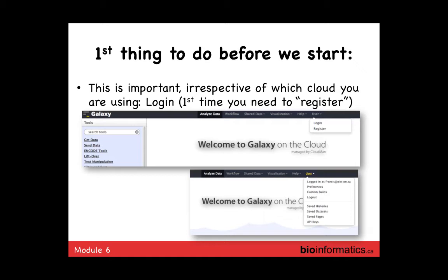Before you start in usegalaxy.org, it's good to log in and register. If you're new to the public instance, you'll register as a new user. Even if you registered on the cloud before, you'll need to register again because this is a new machine that's never seen you. Once you've registered and logged in, you'll see your full account information — the ability to save, view history, saved items, and so forth.